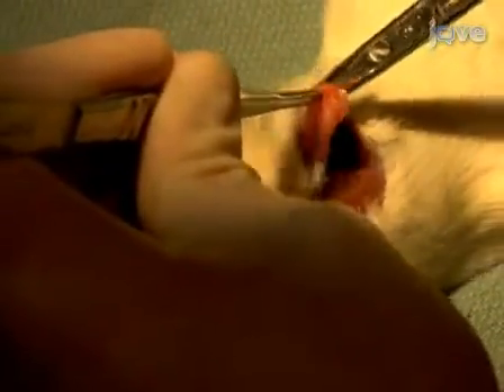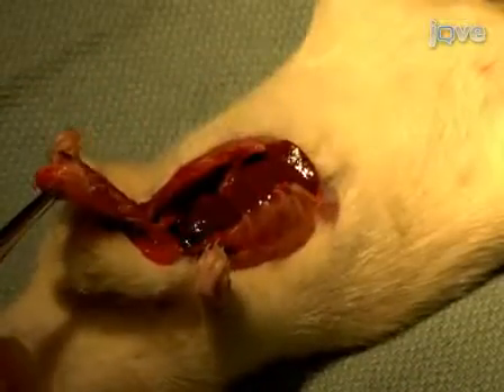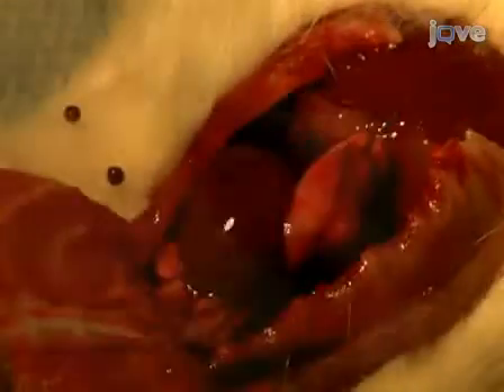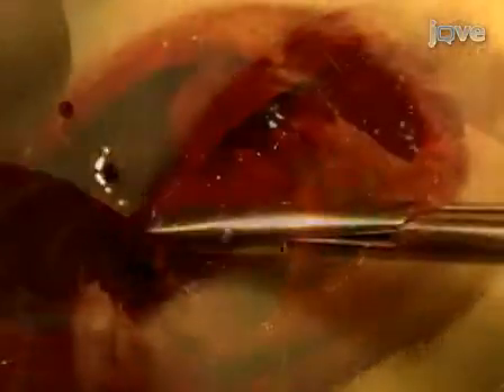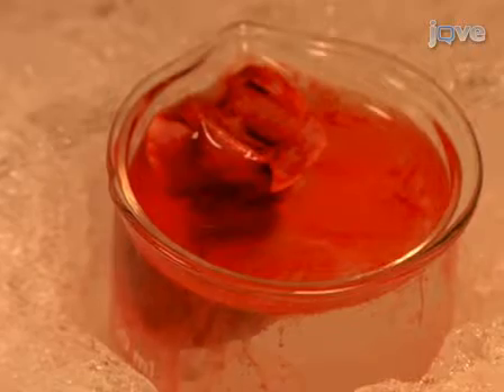Carefully dissect the surrounding tissue and open the pericardial sac. After identifying the inferior vena cava, ligate this vessel with 5-O prolene sutures and explant the entire heart-lung block. Immediately place the tissue in ice-cold Krebs-Henseleit solution in a 50 ml beaker on ice.